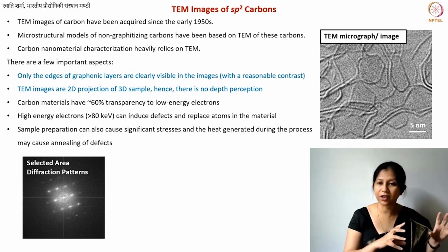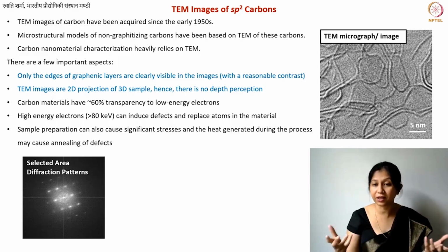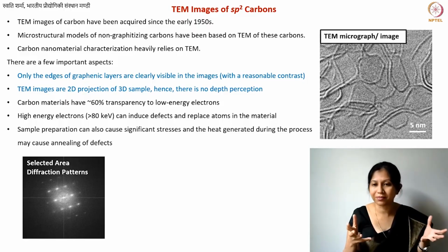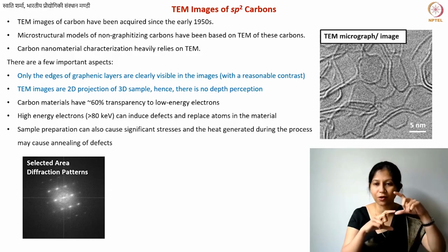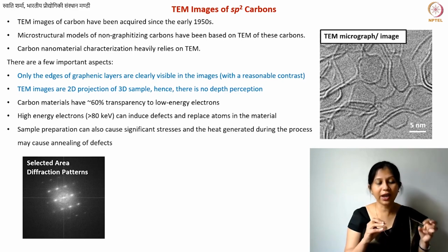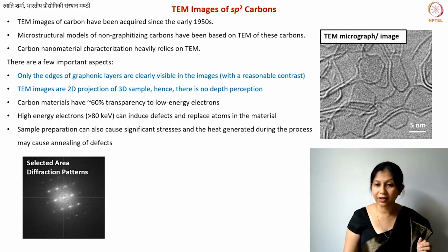Accordingly, for all types of structures, FCC, BCC, all different crystal structures, there exist some rules of thumb that if this is the ratio of the two, then it could potentially be an FCC. It's not that simple, but the point is that you can obtain this information just by looking at the diffraction pattern. You can potentially say that, okay, this is an FCC, this is a BCC.